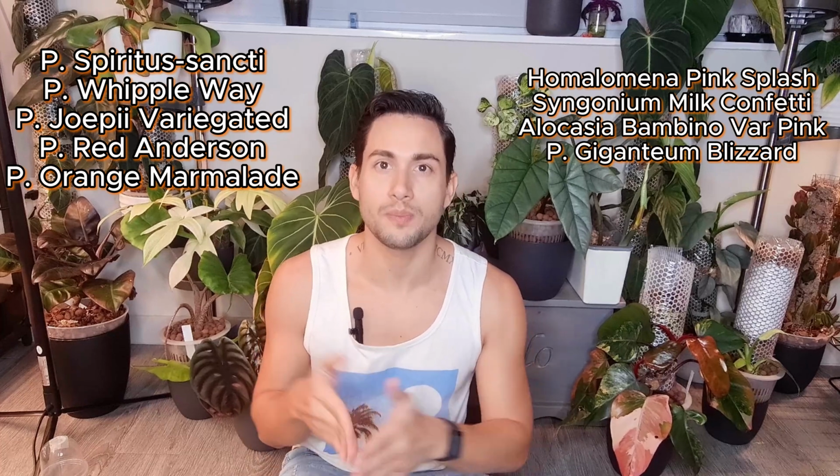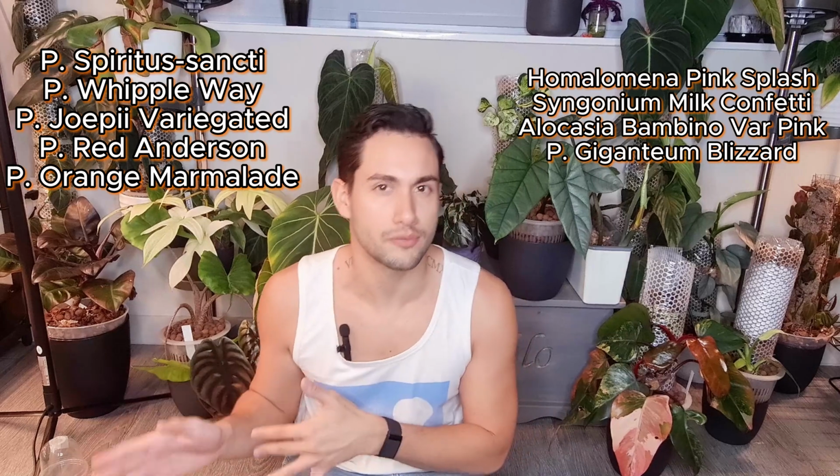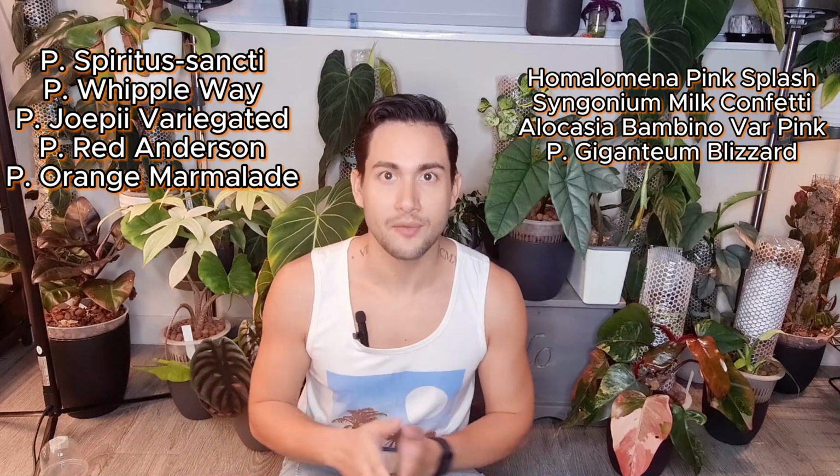So here's the list of all the plants that I am going to be deflasking and working with in this video. I took the first one and I'm going to basically do it with you and walk you through the process and kind of like how I do it. It was with my Whipple Way, which was contaminated with some mold.